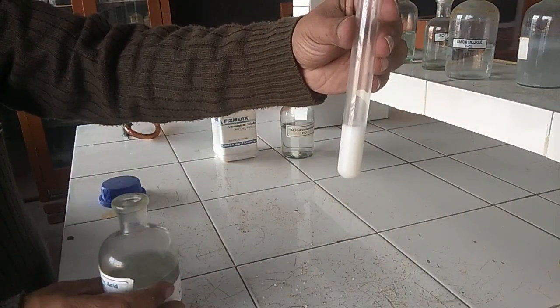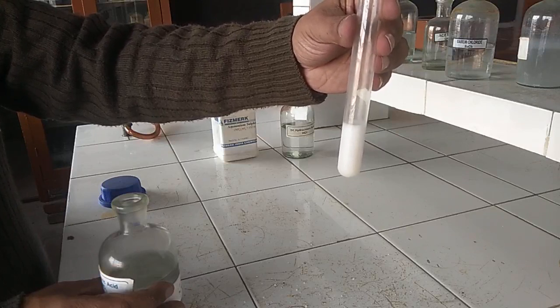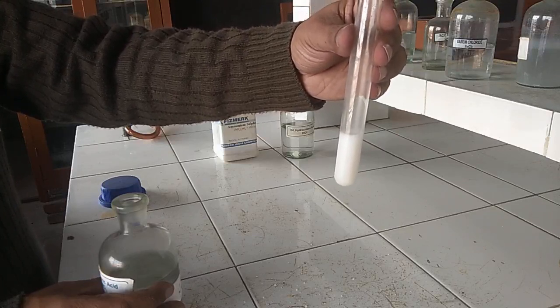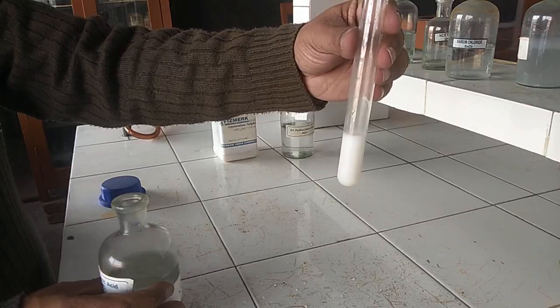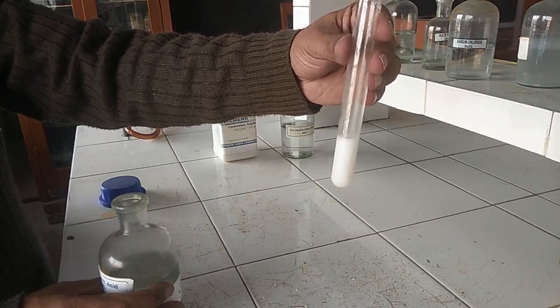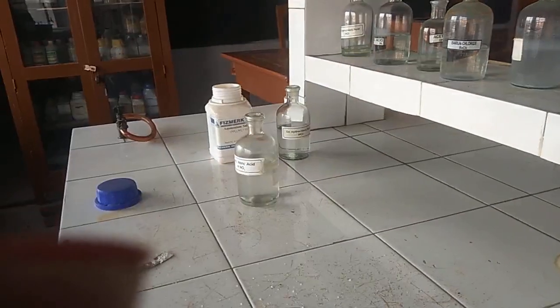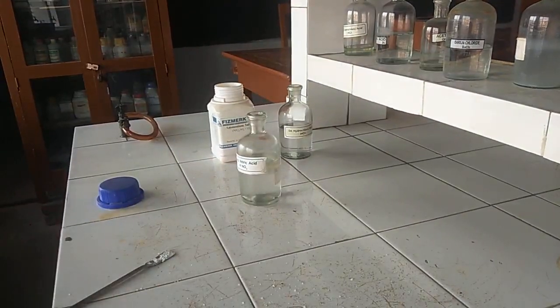This confirms the presence of sulfate ion. The confirmatory test is this only. If the precipitate does not get dissolved in concentrated acids, that means the precipitate formed is of barium sulfate only. The white precipitate is insoluble in all inorganic acids.